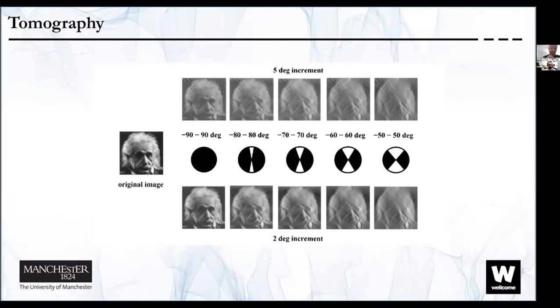So this diagram is just a representation of if you put Albert Einstein in your electron microscope and did the tomography of him, how much information would you miss if you were to have this missing wedge artifact? And you can see that further to the right, you've got this kind of unique visual appearance that is quite recognizable, and the information gets poorer and poorer in quality.